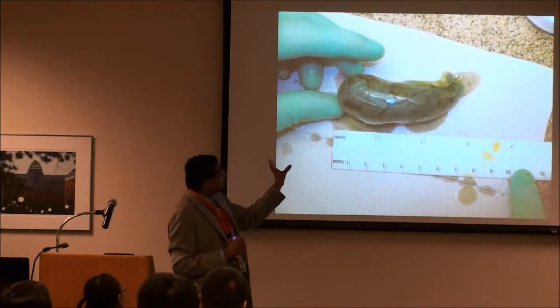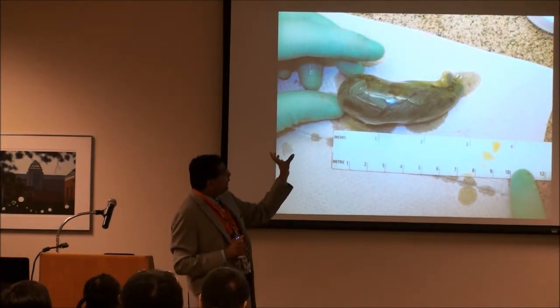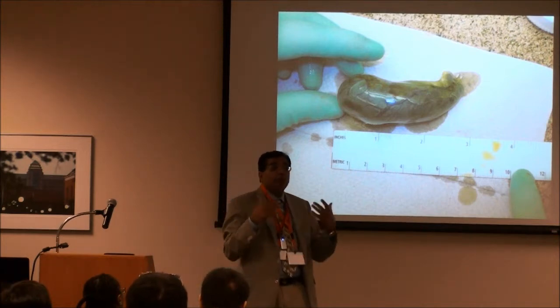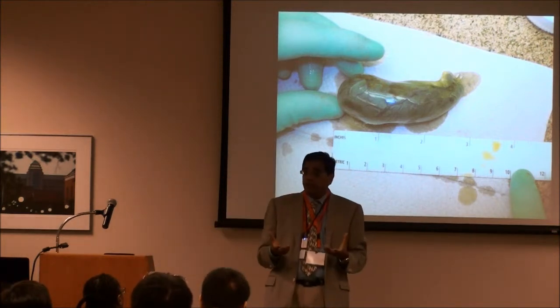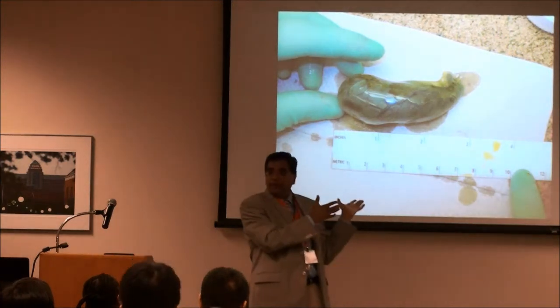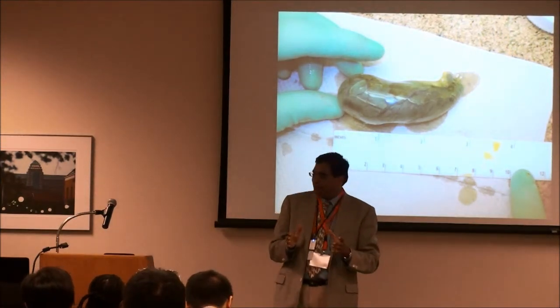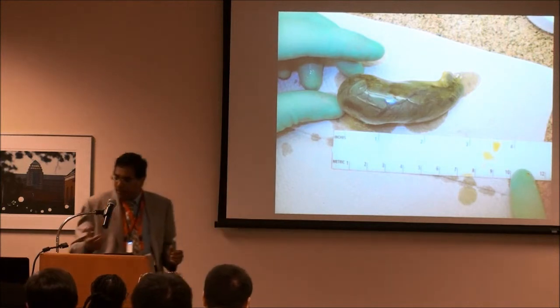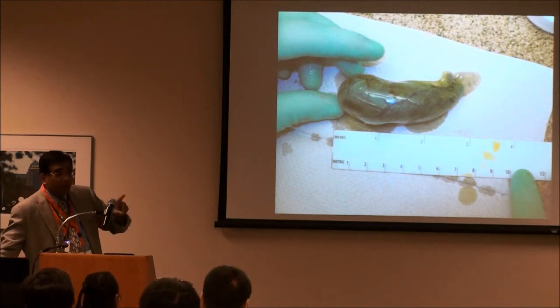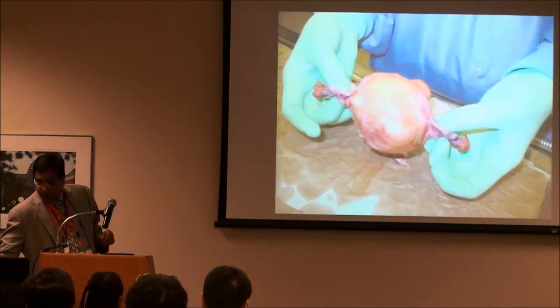So the process of looking at the specimen macroscopically or visually is called grossing in, okay? It's not because it's gross, but it's called grossing in. So if you hear a pathologist say that I'm grossing in right now, it means that they're looking at the specimen macroscopically, not micro, macroscopically.